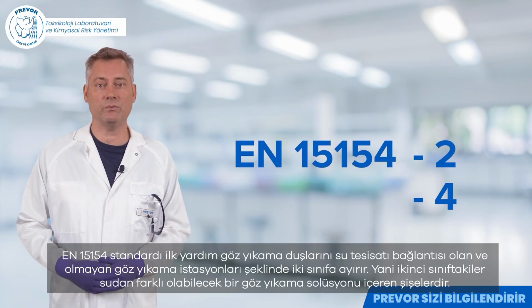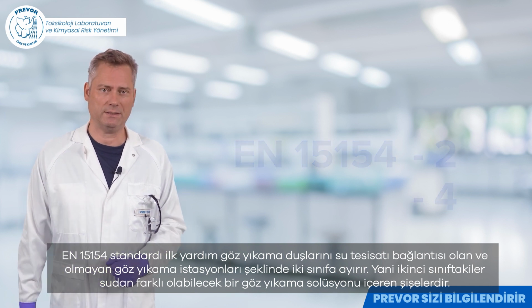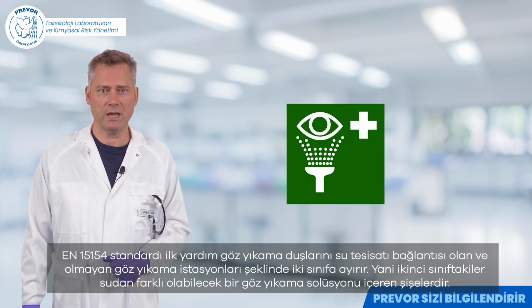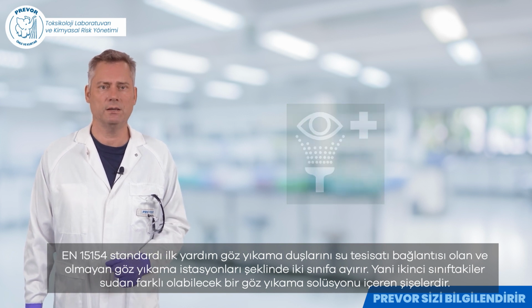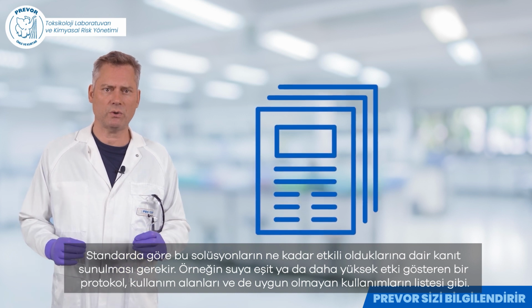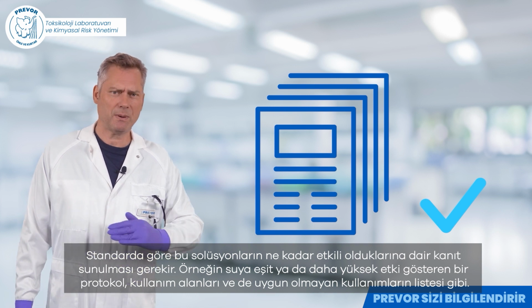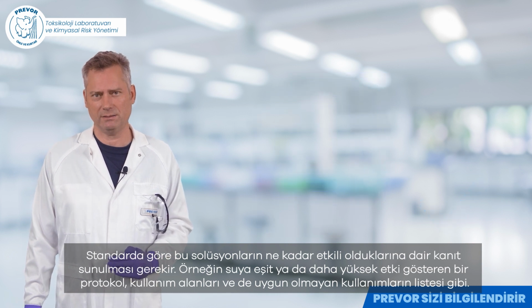The EN 15154 standard breaks down the first aid eye wash devices into 2 families: eye wash stations with or without a water connection. The latter are therefore bottles containing an eye wash solution that may be different from water. The standard requires these alternative solutions to have evidence on their effectiveness, such as a protocol with an effectiveness equal to or greater than water, a spectrum of action, as well as the list of their incompatibilities.